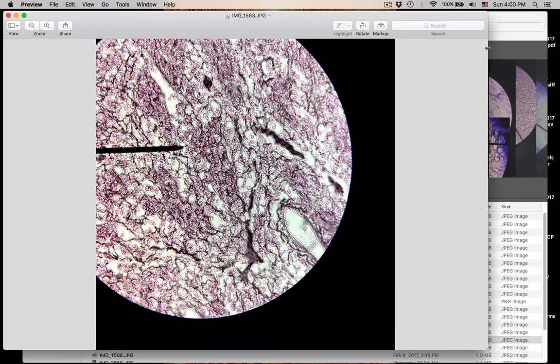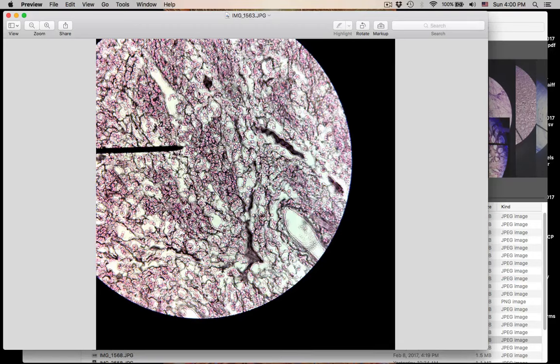Seeing it again. This one's not quite as clear, but you can see the protein fibers — these black branching protein fibers. Number seventeen: what is the name of this connective tissue? Then name these black protein fibers — what are these black branching protein fibers called? And where would you find this connective tissue? Three parts to number seventeen: name the connective tissue, what kind of protein fibers are these, and where in your body would you find this type of connective tissue?